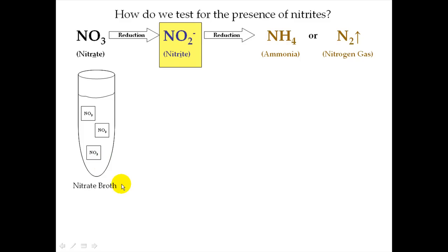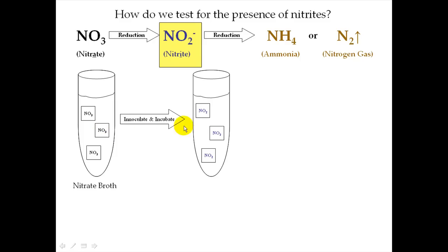After you incubate this tube, if the bacteria that you put into that tube were able to reduce the nitrates to form nitrites, the way you'd be able to visualize that is that after this incubation period, you add, again, stuff that basically serves as nitrite detectors. And the chemicals that serve as nitrite detectors are sulfanilic acid and alpha-naphthylamine.